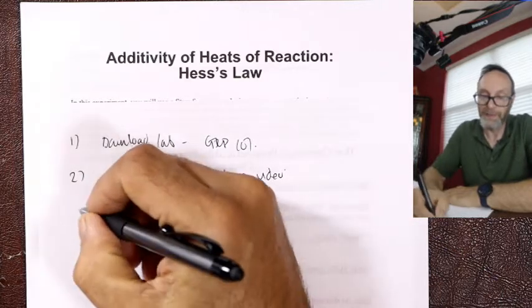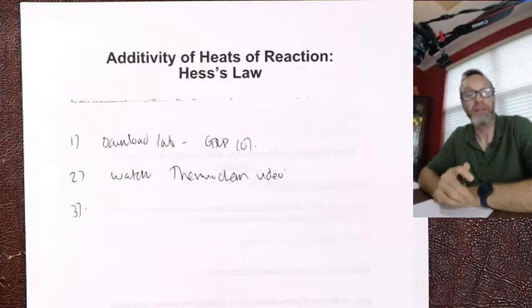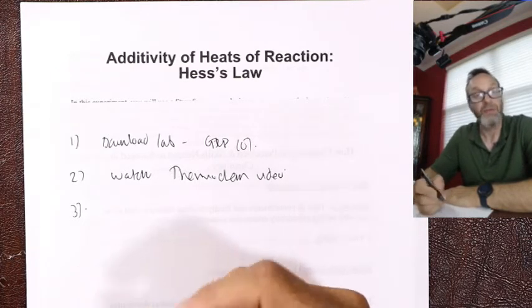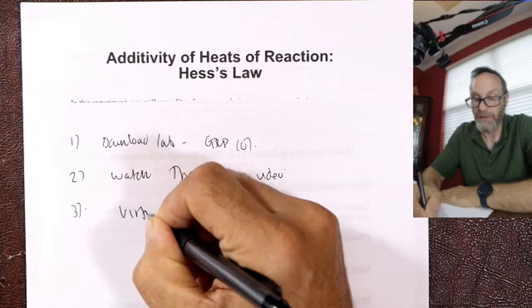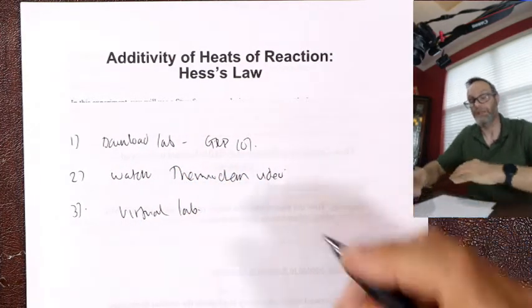And then number three, well, we'll meet it as we go through. You actually have to go online to a different website. I'll point out the address in a moment. You do the virtual lab online, and you just basically follow the instructions. So let's just take a look through.